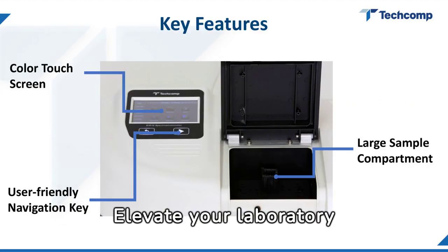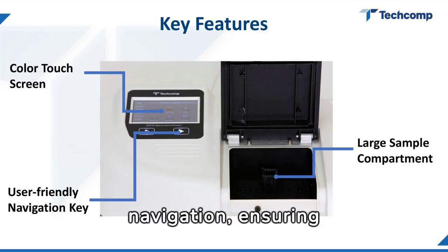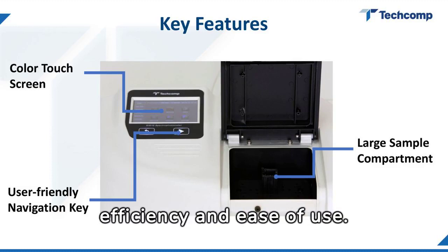Elevate your laboratory experience with a color touchscreen, expansive sample compartment, and intuitive navigation, ensuring efficiency and ease of use.